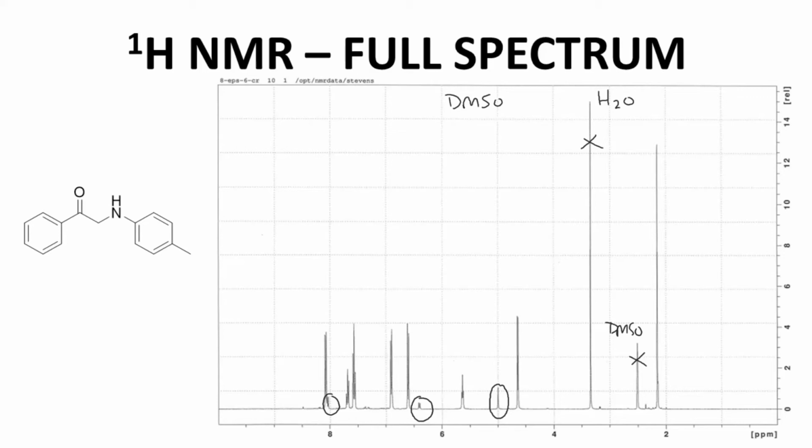I'll identify the impurity later. I don't want to go into full details. The purpose of this video is to show off an experiment, but I will make a separate video that will go into the analysis of this spectrum so we can try to identify what this compound is. I will identify it. I just don't want to go through all the long, gory details because maybe you're here just to see an experiment and see data gathered. But I think there is a time and place to talk about this spectrum. So let's go into this, but we know there are going to be some impurity peaks here.